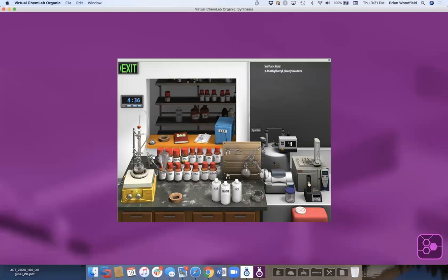So I'm going to drag my sep funnel, put it on there. So now I have my product mixture at the bottom. Now I get to choose which is the right aqueous reagent to use. So sometimes you're going to want to rinse with an acid or base or just water, and we allow any of those outcomes. You can do countercurrent extractions. So you can drop something into the aqueous layer if you want to separate it. Up to you, and this one isn't the case here. So I'm going to go add my water. Now I have my aqueous layer, which has nothing, and I have my organic layer up here. And I'm going to go drag my organic layer.